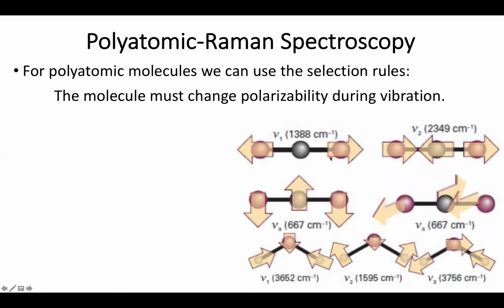And this change in how diffuse the electrons are actually ends up influencing the polarizability of the molecule. So it turns out that this V1 state, while it is IR inactive, is Raman active. So this is a good way to try and back out information about this state.